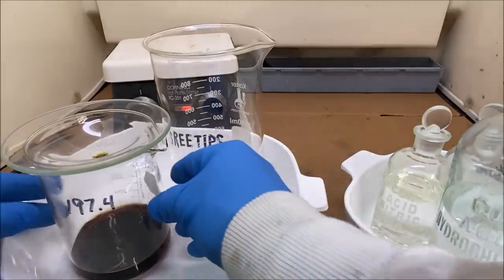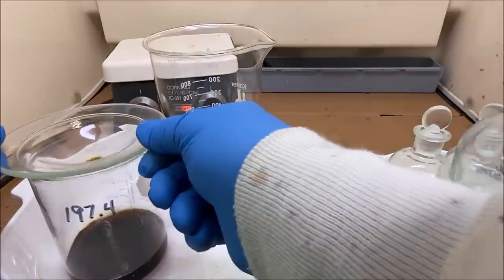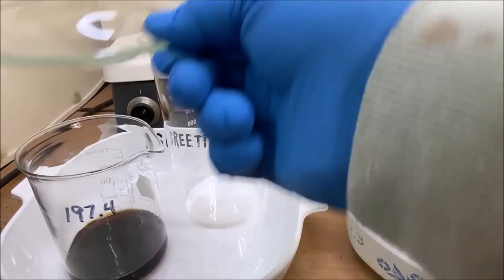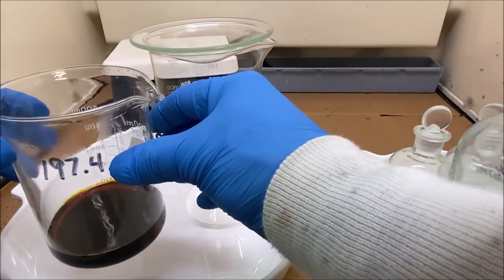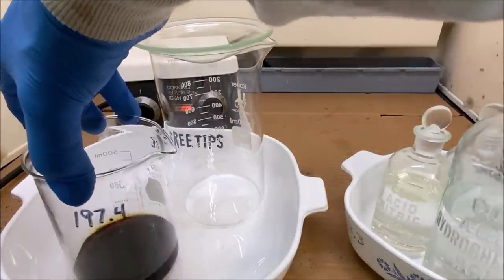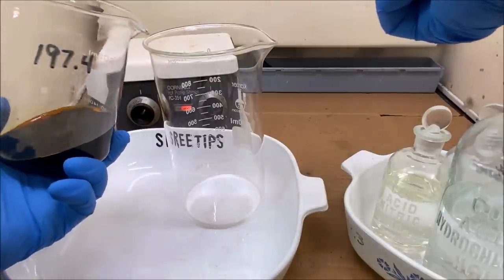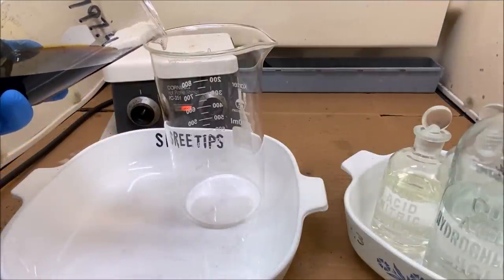I let my solution evaporate down too far. I saw it was getting real syrupy, so I went in to put my camera on to get it off of there. When I came back out, it had nearly evaporated to dryness. And I took it down off the heat and rehydrated it with some hydrochloric acid here. I didn't get that on camera. So that's what we got going on here. I hope everything's going to be all right.